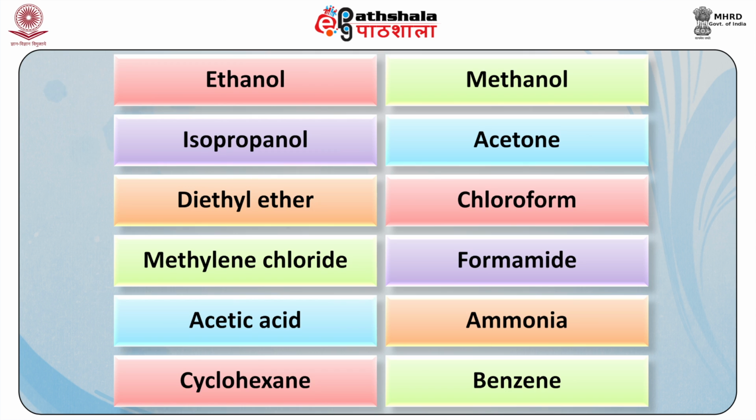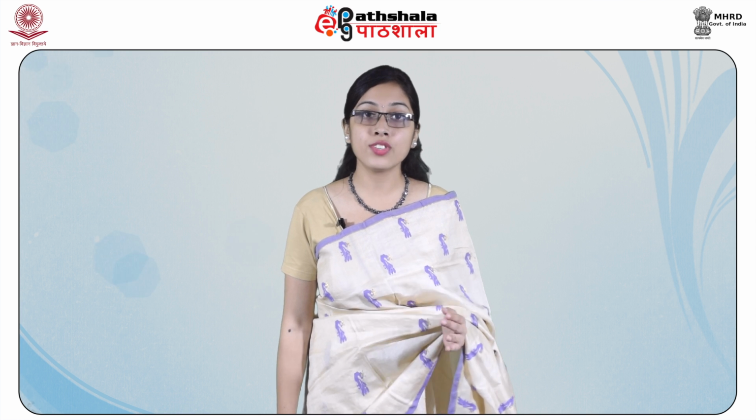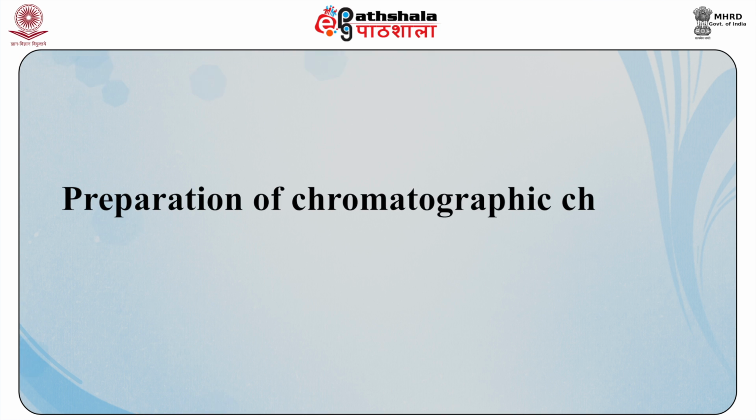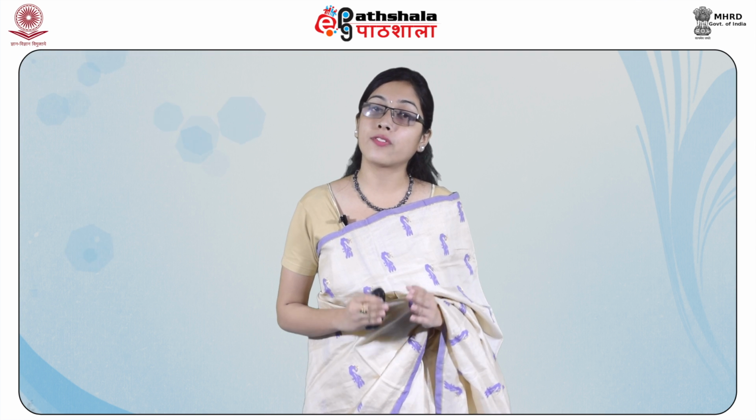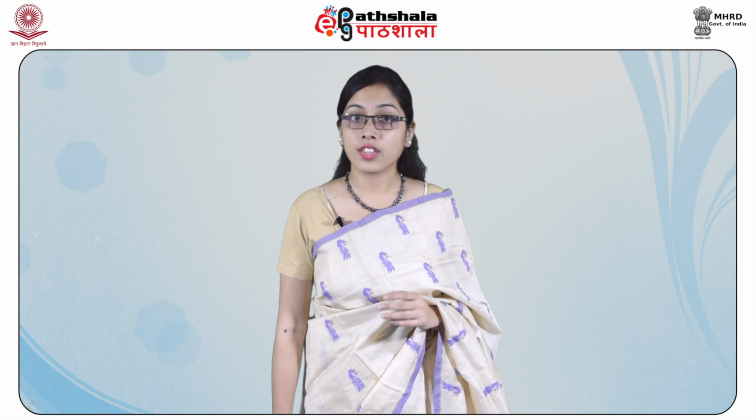Usually solvents such as ethanol, methanol, isopropanol, acetone, diethyl ether, chloroform, methylene chloride, formamide, acetic acid, ammonia, cyclohexane, benzene can be used alone or as a mixture as a mobile phase. The general procedure that is followed in case of paper chromatography follows sequential steps, wherein the first step is preparation of chromatographic chamber. The procedure starts with equilibration of chamber with solvent vapors. The pre-saturation of chromatography chamber is carried out well in advance before the development.